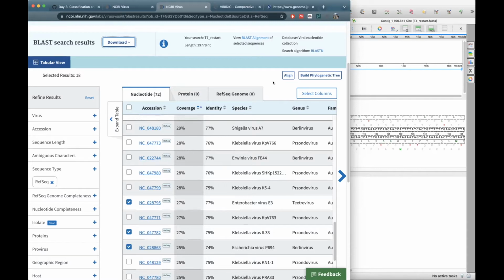The person behind the help ticket said, you'll have to start increasing the number. Try with 5 if that works. Try with 10. I didn't really go much further. Well, we can see what it does if it works for 72.